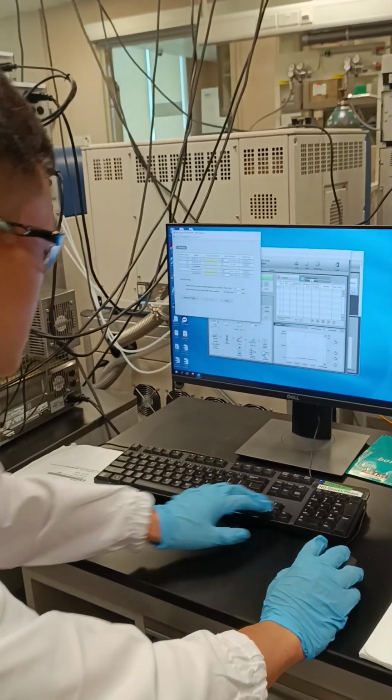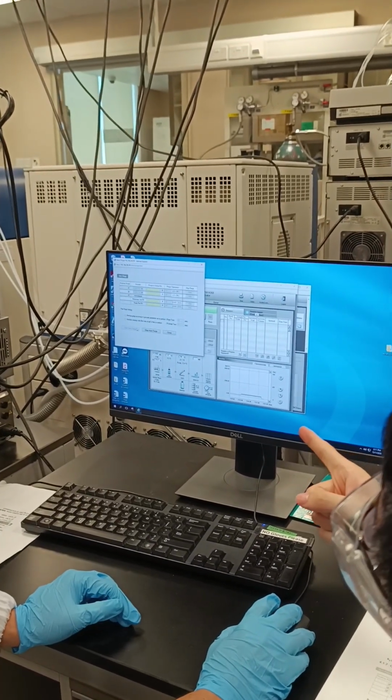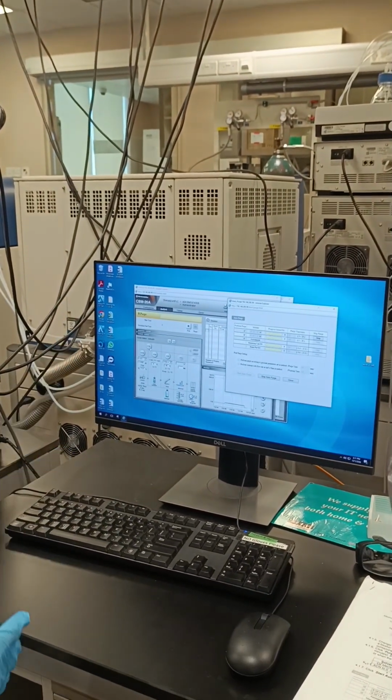So now we just go through the first step. And this will take a long time. Everything is just changed to 10 minutes. Then you just start auto purge. Where do you open that? It's just here, purge. Oh, okay. So this one will take quite some time.